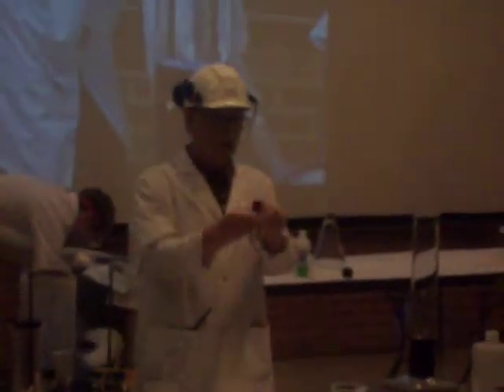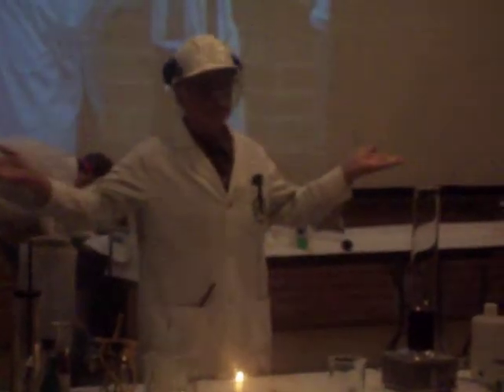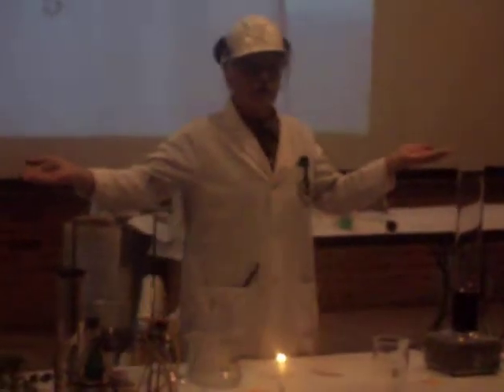So I have in my hand here a wooden splint, a piece of wood. I'm going to break it up into some smaller pieces so you can see that there are now smaller pieces of wood. That will be a physical change. I haven't changed the nature of the material itself. It's just smaller pieces of wood. As the dry ice sublimes, that is a physical change.